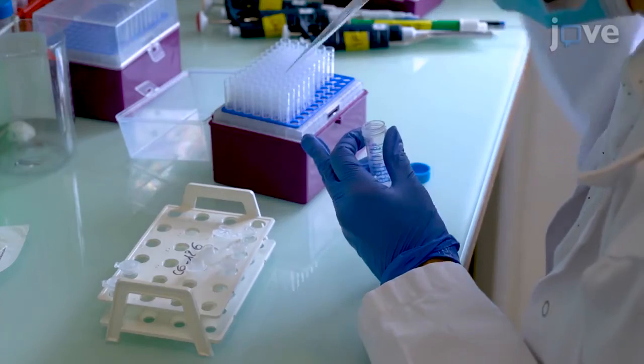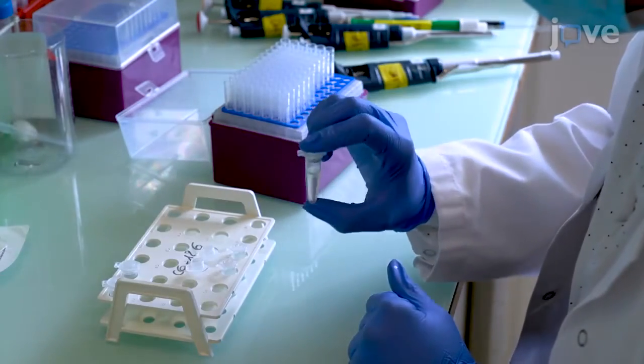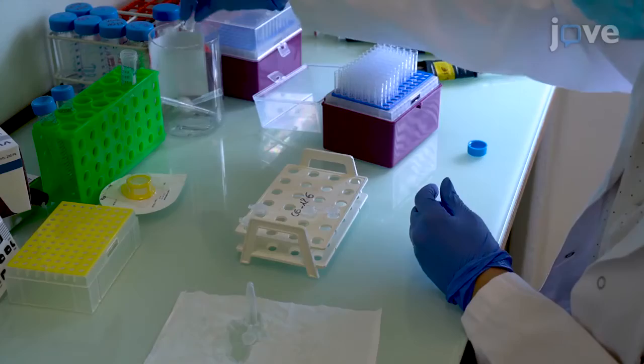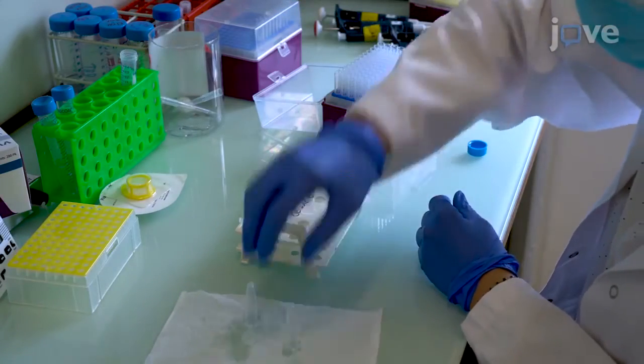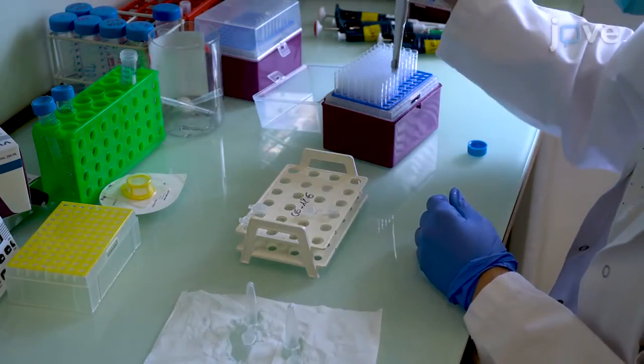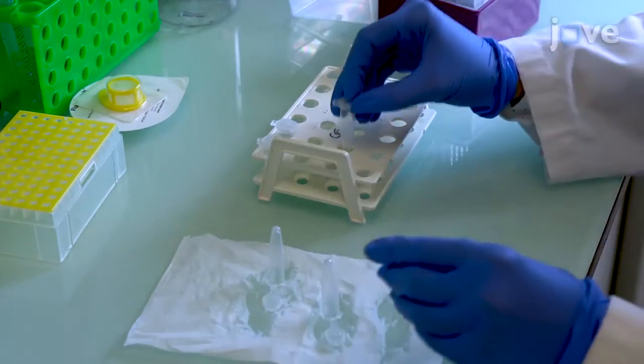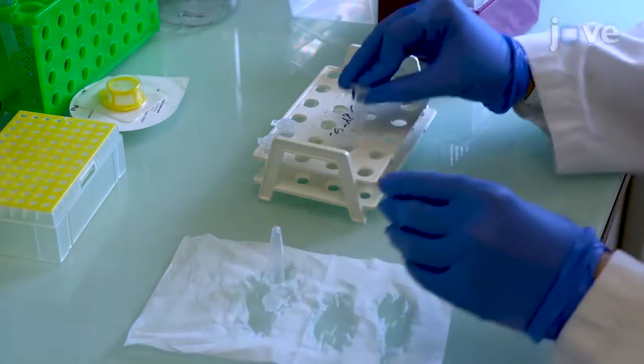To coat the tubes, fill them with BSA and invert them three times. Remove the solution and air-dry the tubes upside down on clean tissue paper for two hours. Coat one collection tube and one 1.5 milliliter tube per sample.